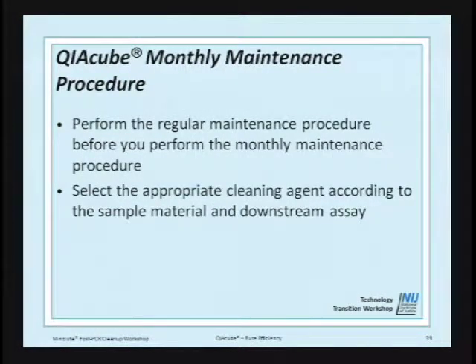As far as monthly maintenance, we just recommend wiping it down with a detergent, and that's really it. It really doesn't require a lot of maintenance.